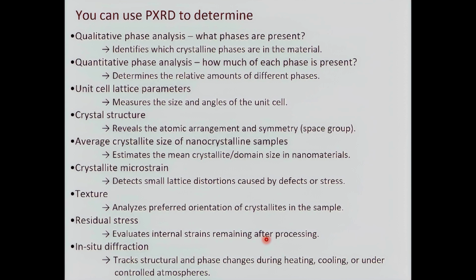But to conclude, I hope that you are starting to understand how difficult it can be to manage diffraction data to obtain what you want. But in this slide, I report some of the applications. You can see that there are a lot. This means that even if it's difficult, we have the possibility to manage the data to obtain what we want, because I repeat, the information is there.